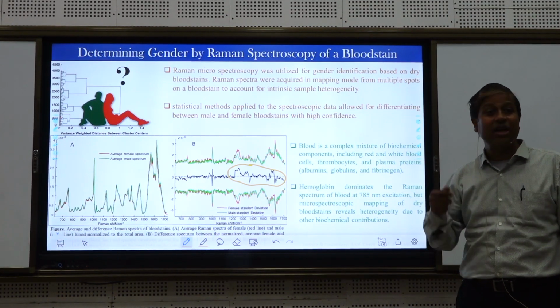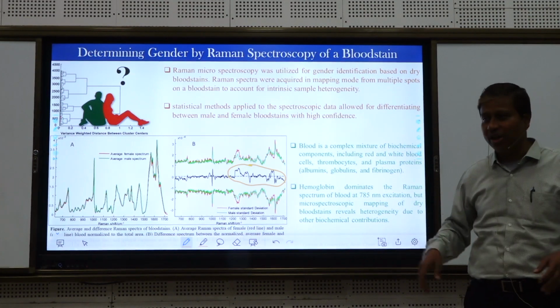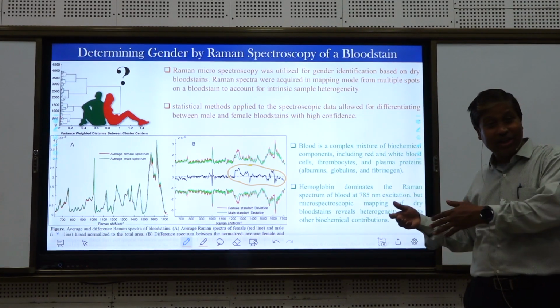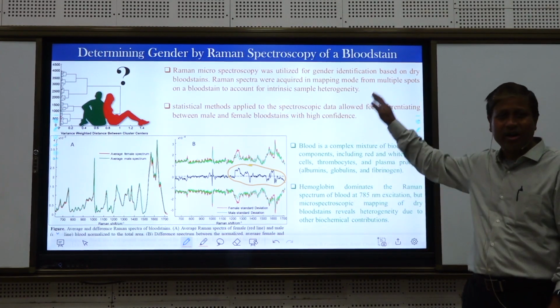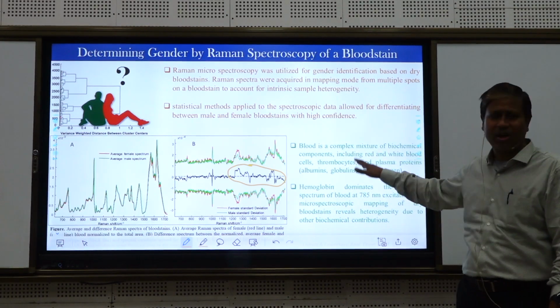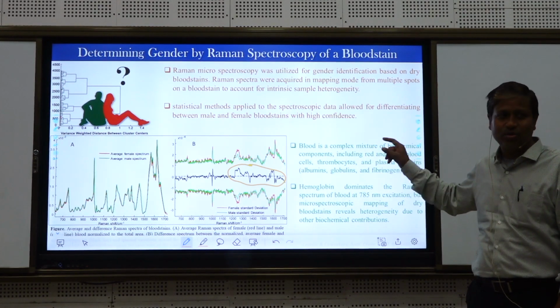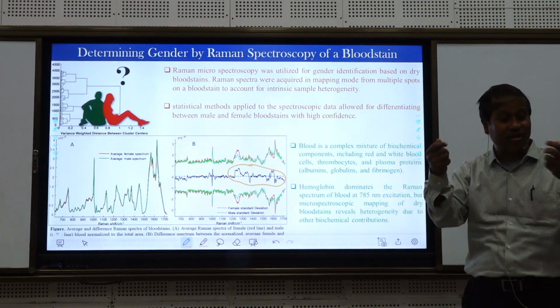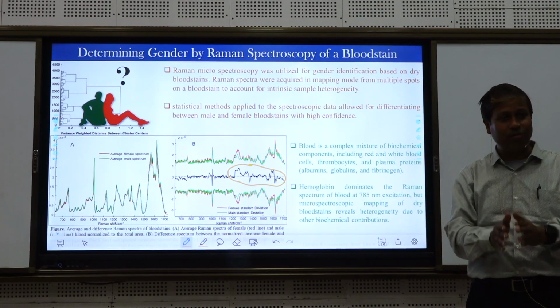If it is human blood, then whether it is peripheral blood, meaning blood circulating in the body, or menstrual blood, or animal blood, or synthetic blood. You will see that so many kinds of studies are there, and for each and every study they have done lots of statistical analysis, because at the end of the study you have to tell the government that your report is a convincing one.